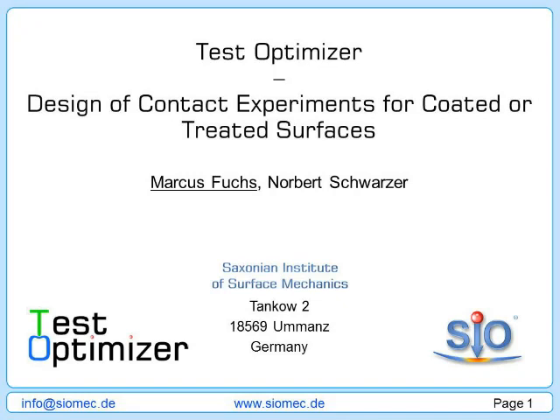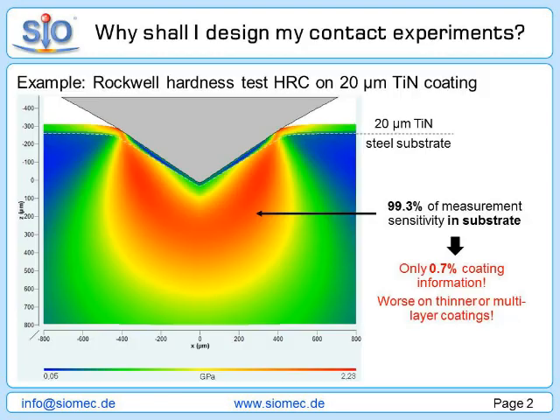Welcome to this tutorial about designing contact experiments like indentation measurements or scratch tests for coated or treated surfaces by means of the software TestOptimizer. First, the question may arise, why shall I design my contact experiments?